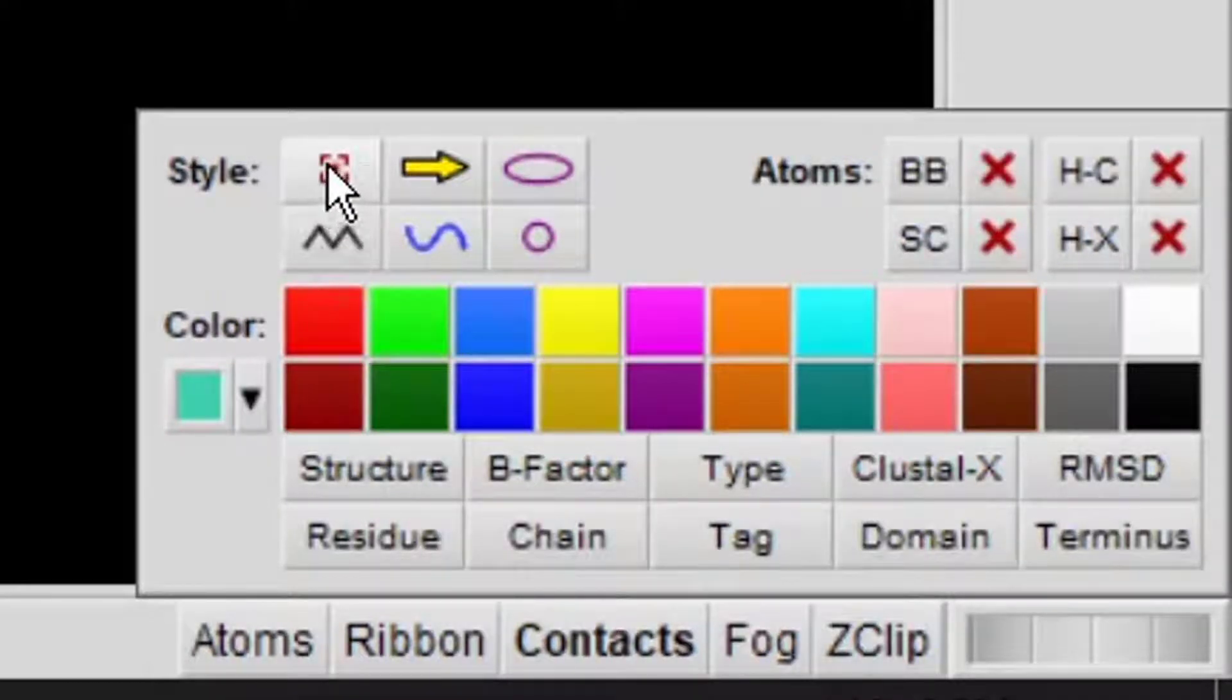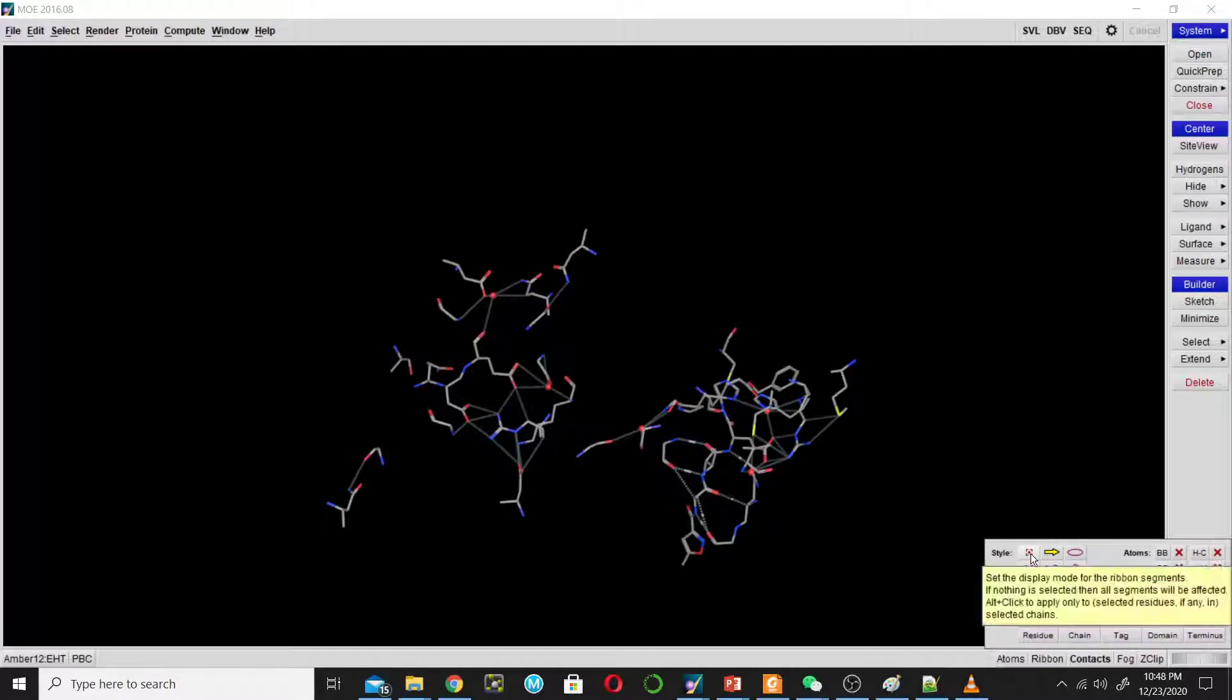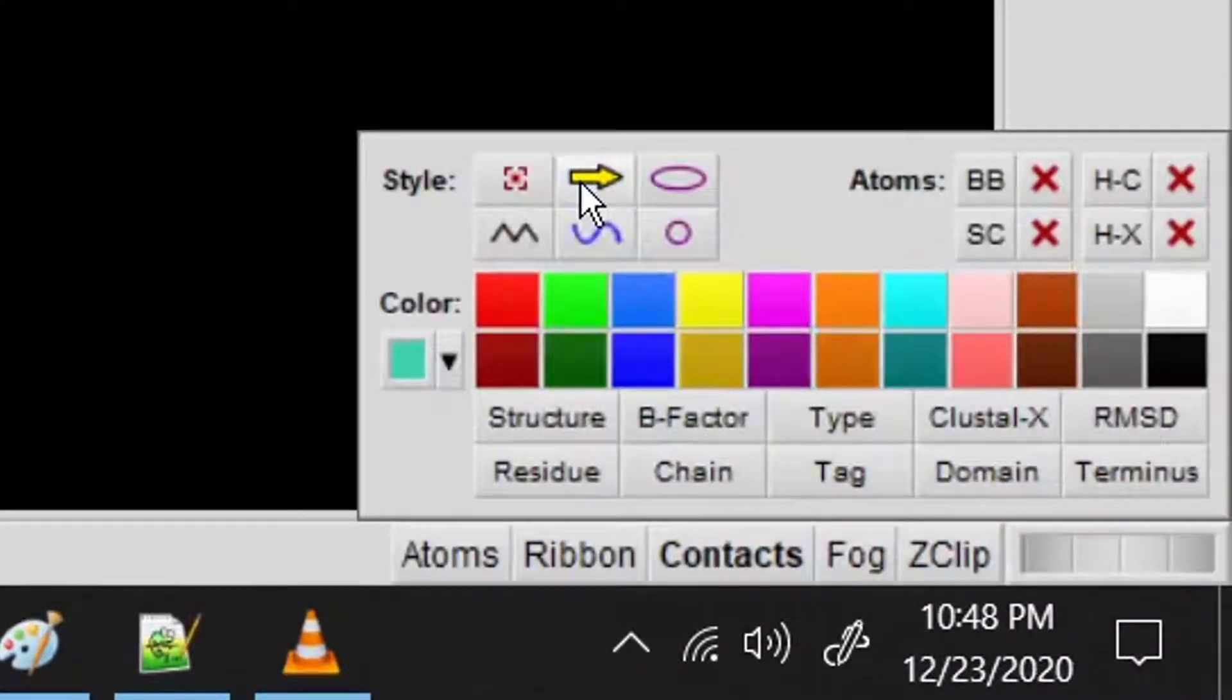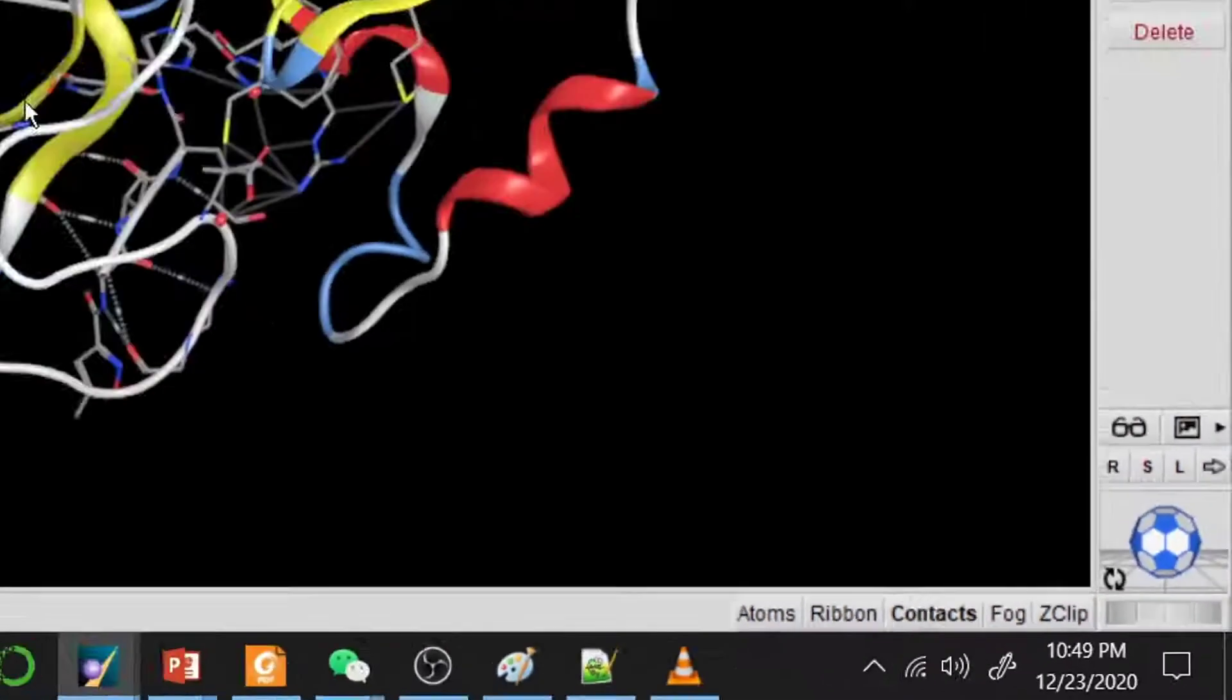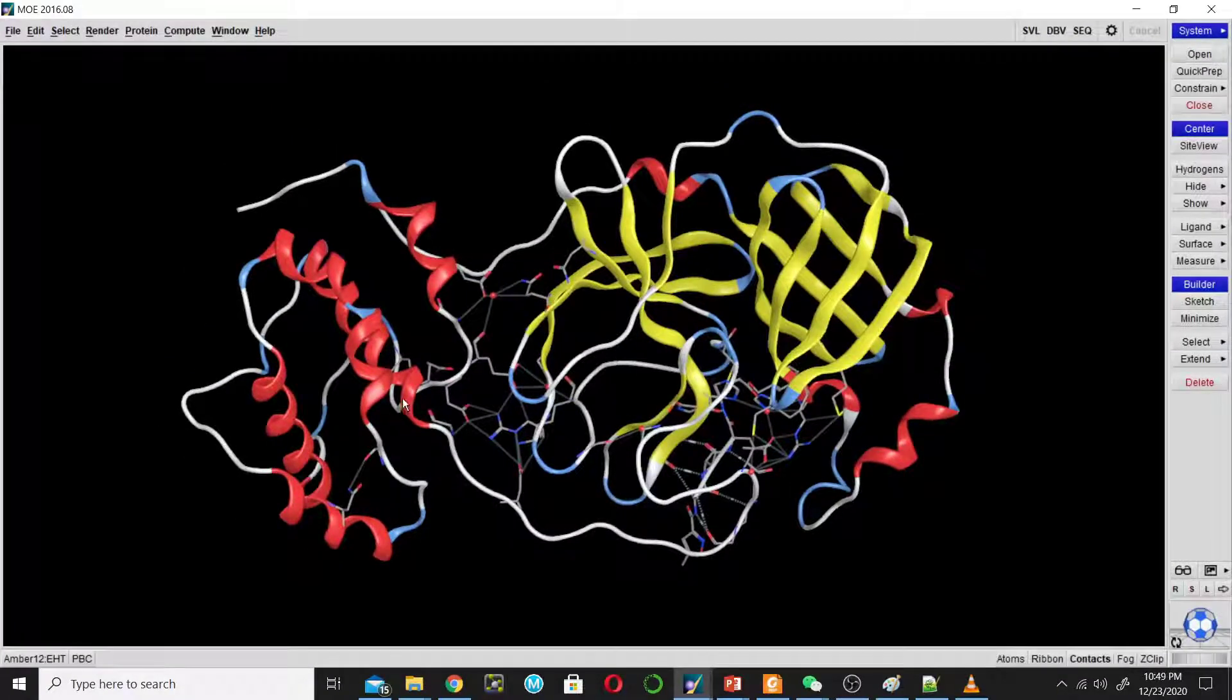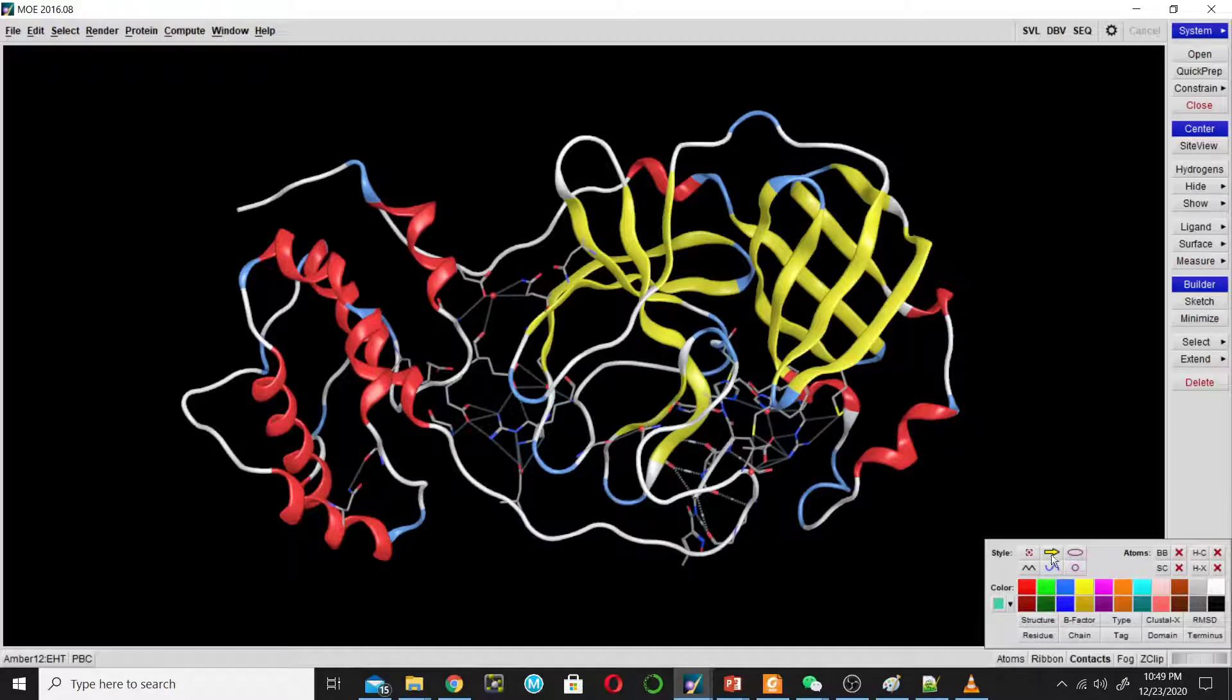By clicking this option you can hide the cartoon representation, and by clicking this option you can show it again. By clicking this option you can show it in different representation. This is a little bit smoother representation compared to this one. I like this one. I always use this representation.